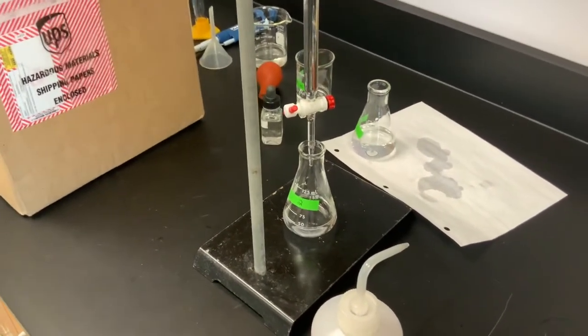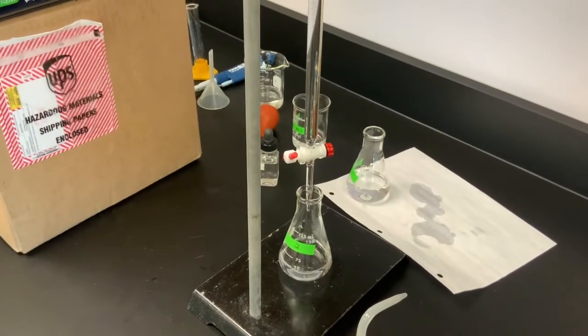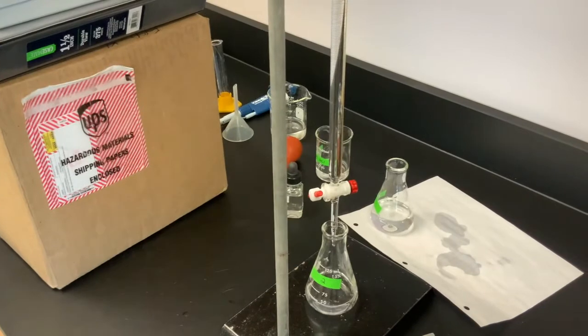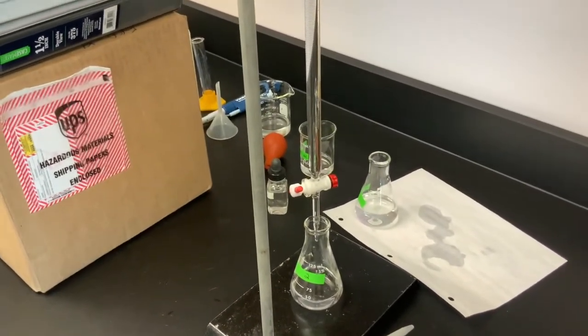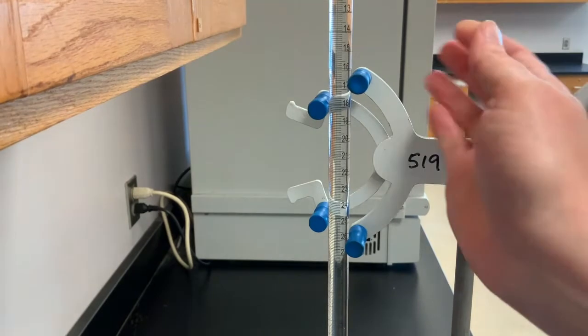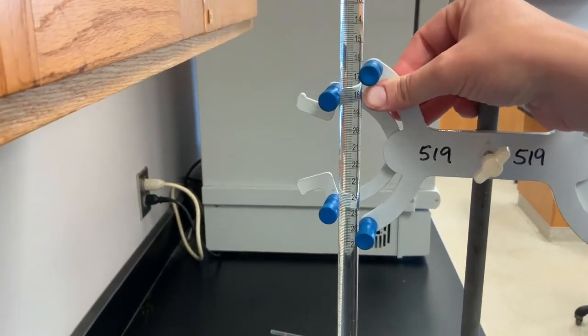So from our previous trial, we know approximately where our endpoint is going to be, and it was between 19 and 20 milliliters. So we're going to add very rapidly till we get to about 18 milliliters, and then we're going to slow it down. And so 19 or 18 milliliters, we're looking at when we get to right around here.